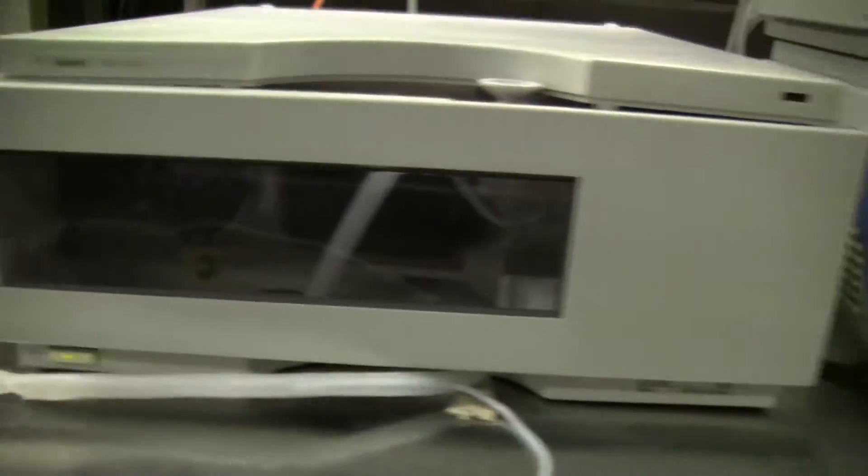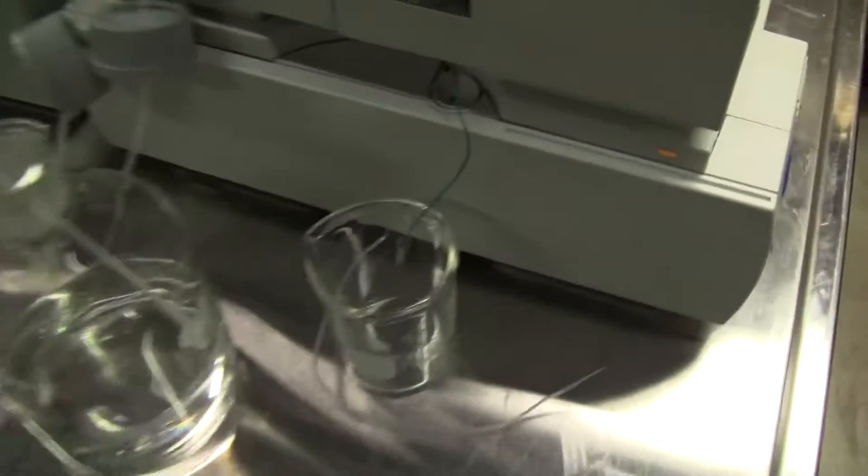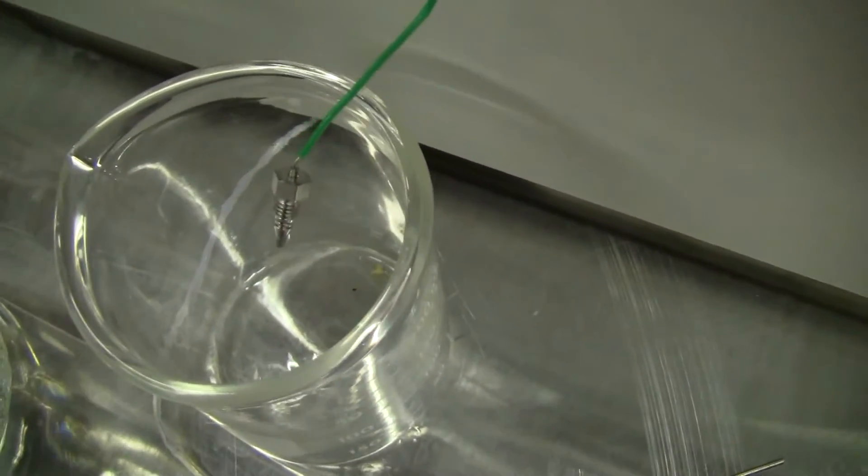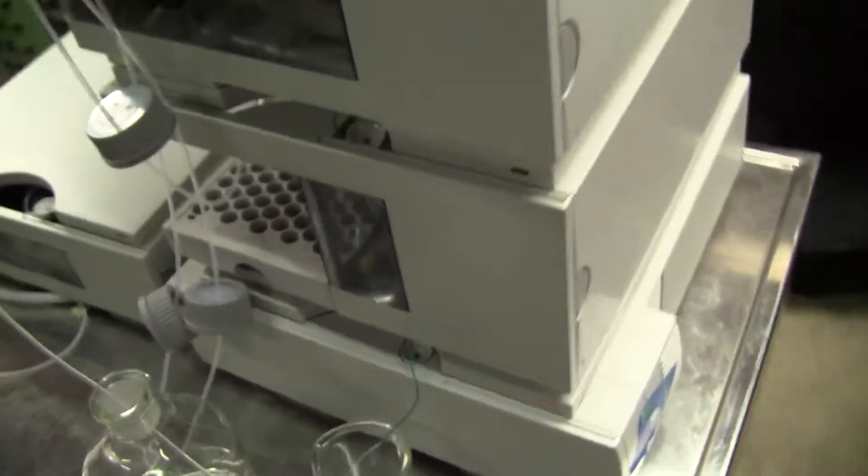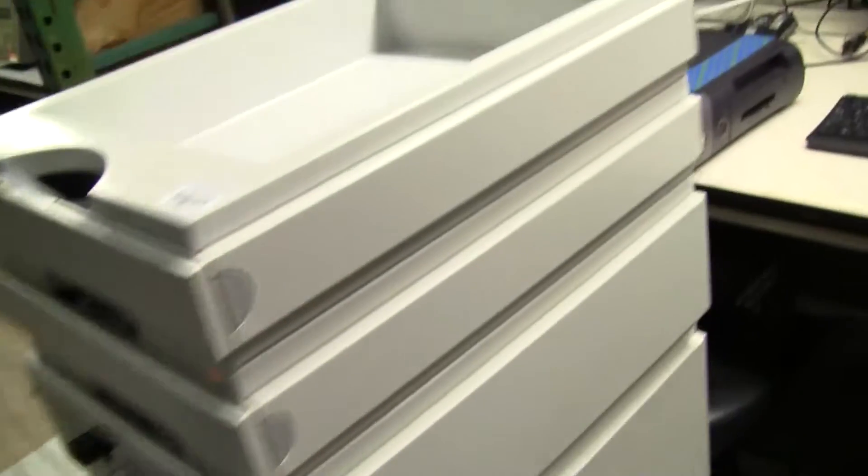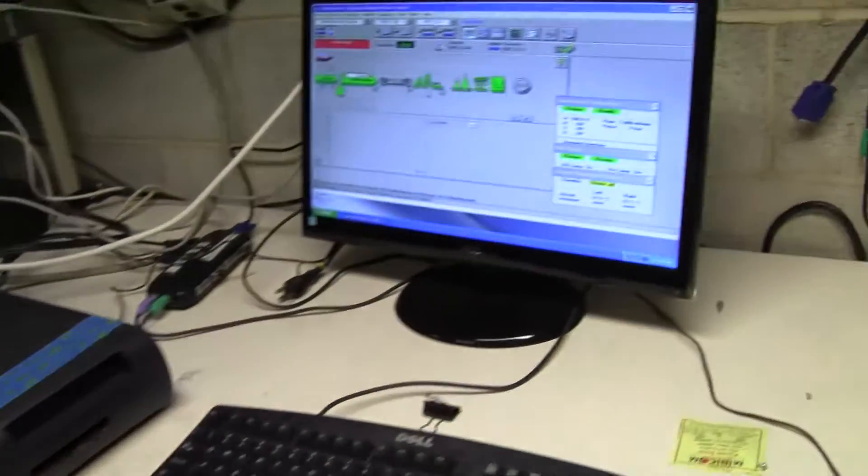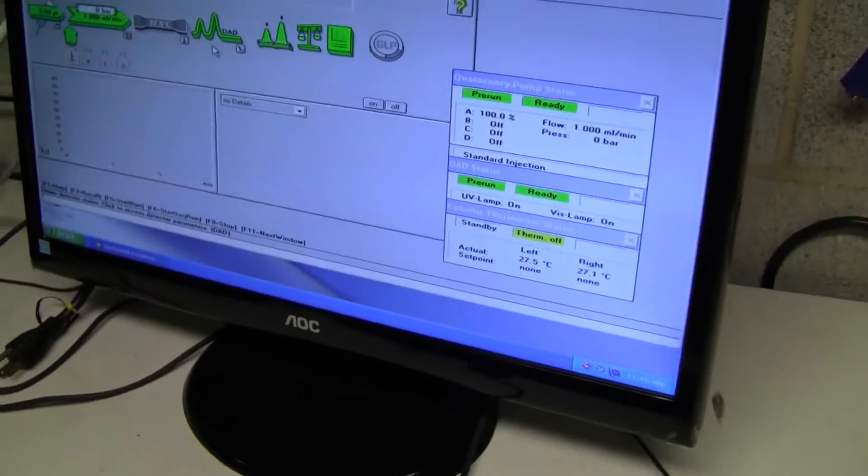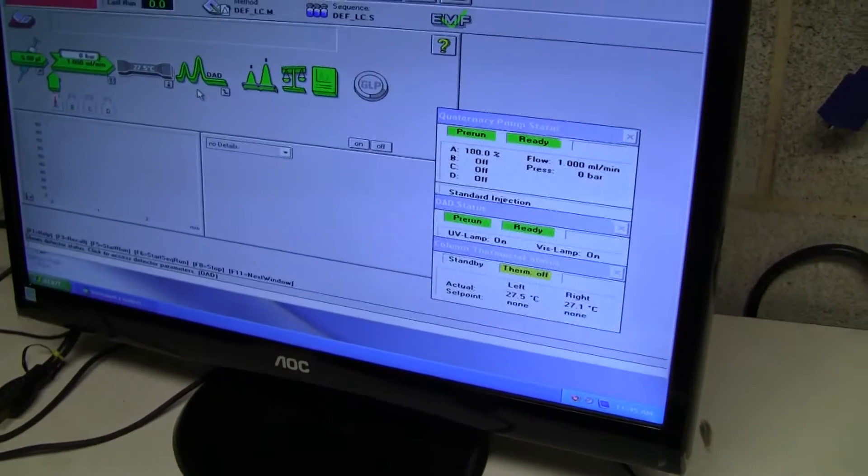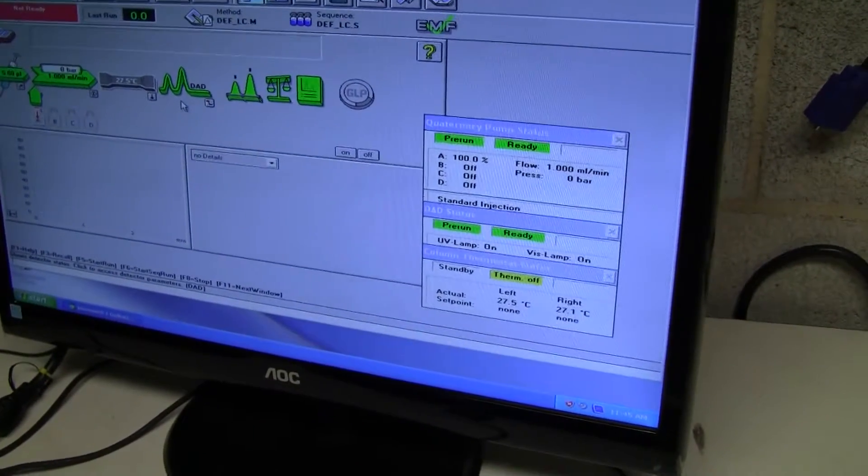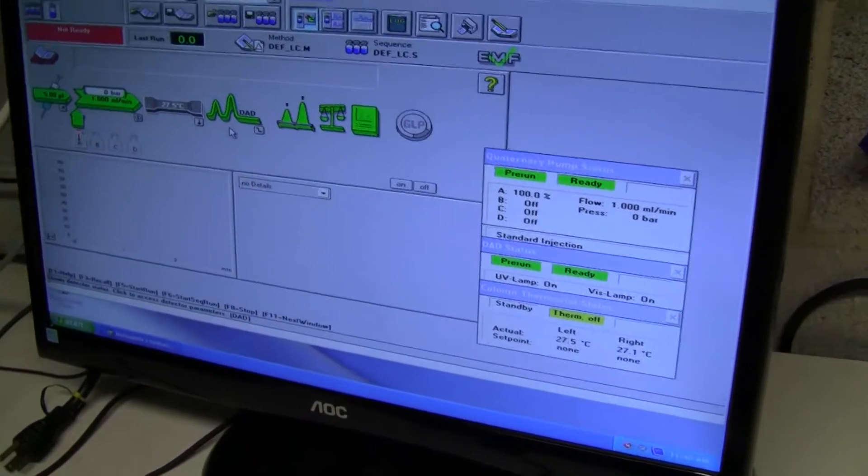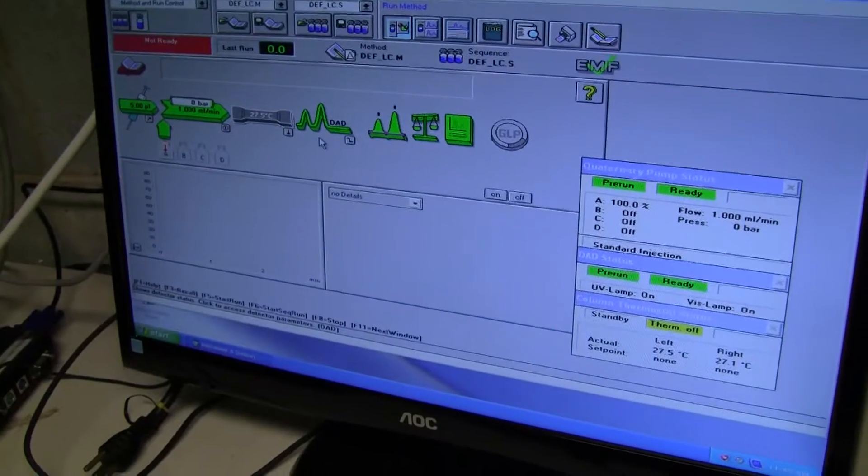Okay, it's running some methanol through it right now. Looking at the unit from a chem station perspective, we can see that we're pumping one milliliter per minute.